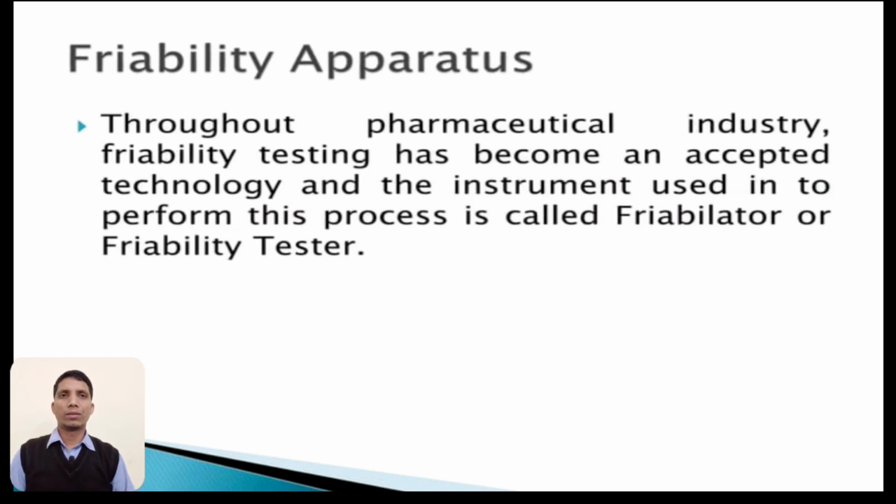Now we will come to the friability apparatus, the instrument used for friability testing. Throughout the pharmaceutical industry, friability testing has become a standard technique, and the instrument used to perform it is called a friability test apparatus or friabilator. This is a very simple instrument, and it is used only for tablets, not capsules or anything else.